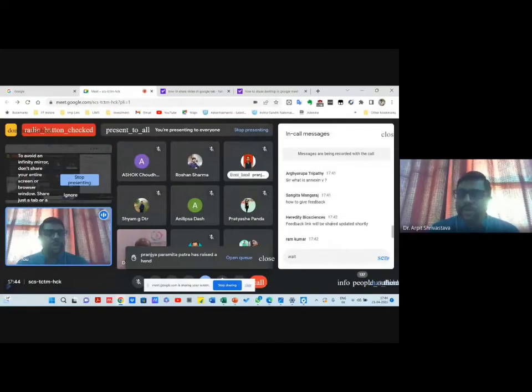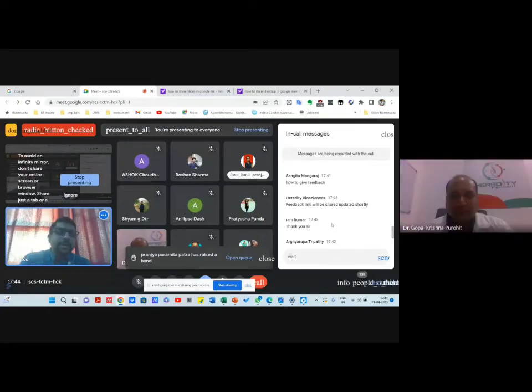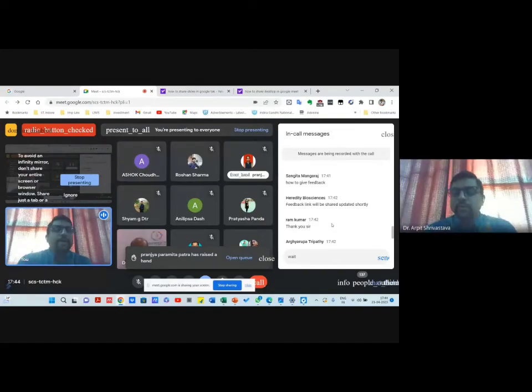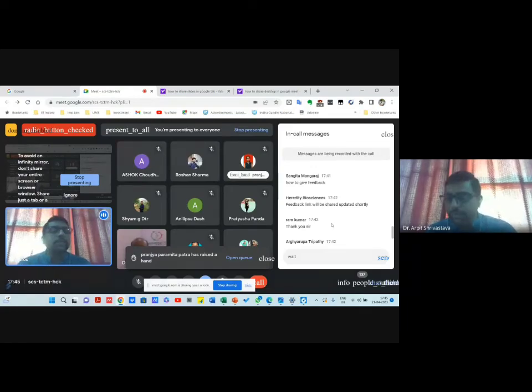My answer is about how sensitive it is. It is extremely sensitive because it depends on the scattering of light and hydrodynamics. So if it is an atom, it will give a different spectrum. But when it is important to do, we have to decide. It is very sensitive, but we have to do it in a proper manner. It should be properly channelized. Otherwise, the interpretation will be difficult.